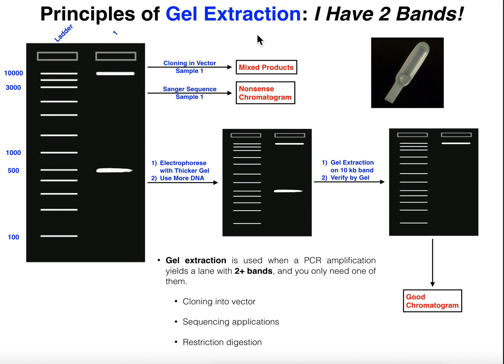But what happens if you actually run a sample after you PCR amplify it and you end up with two bands like this? Sometimes this actually happens — you can have more than two bands — and this is a really big problem if you want to clone, say, this top gene right here, this bigger one at 10,000 base pairs, 10 kilobases. What happens if you want to clone this into an expression vector and force the expression of its protein in a bacterium? Well, the problem is you've got two bands here, it's not pure, so you're going to get a mixture of products and probably some nonsense.